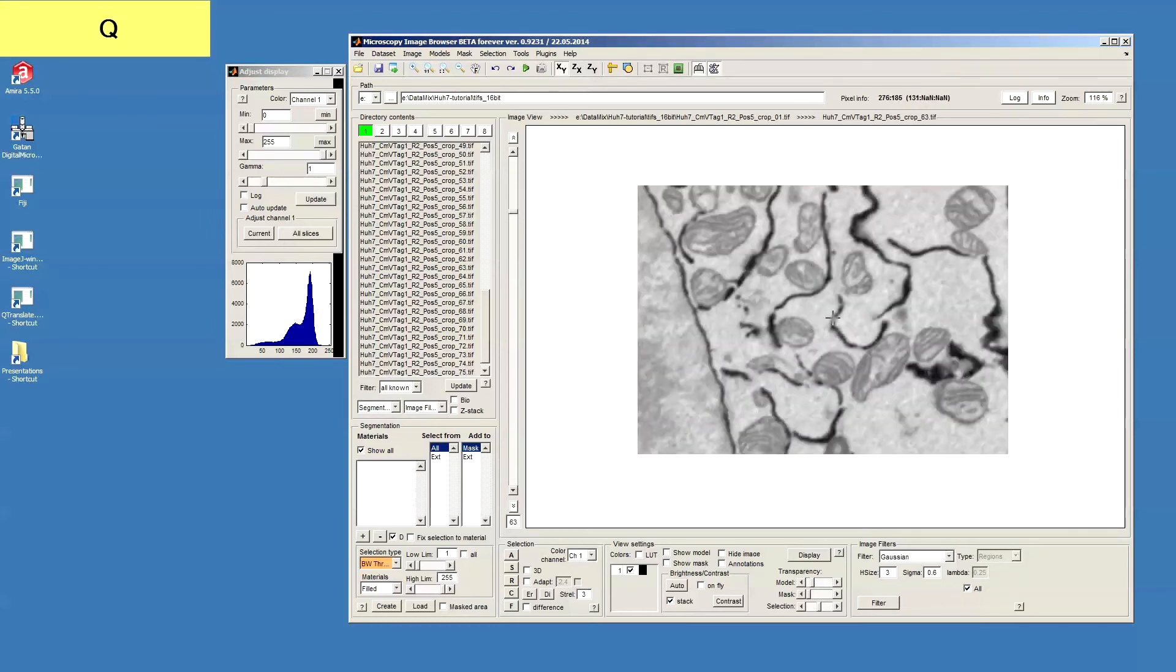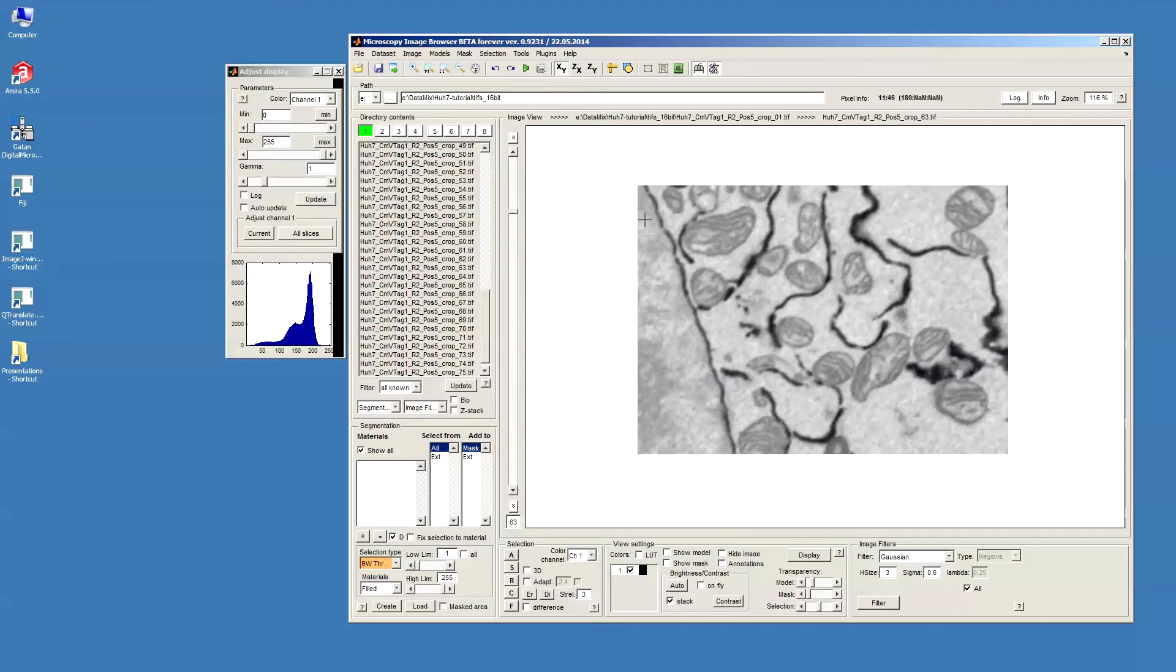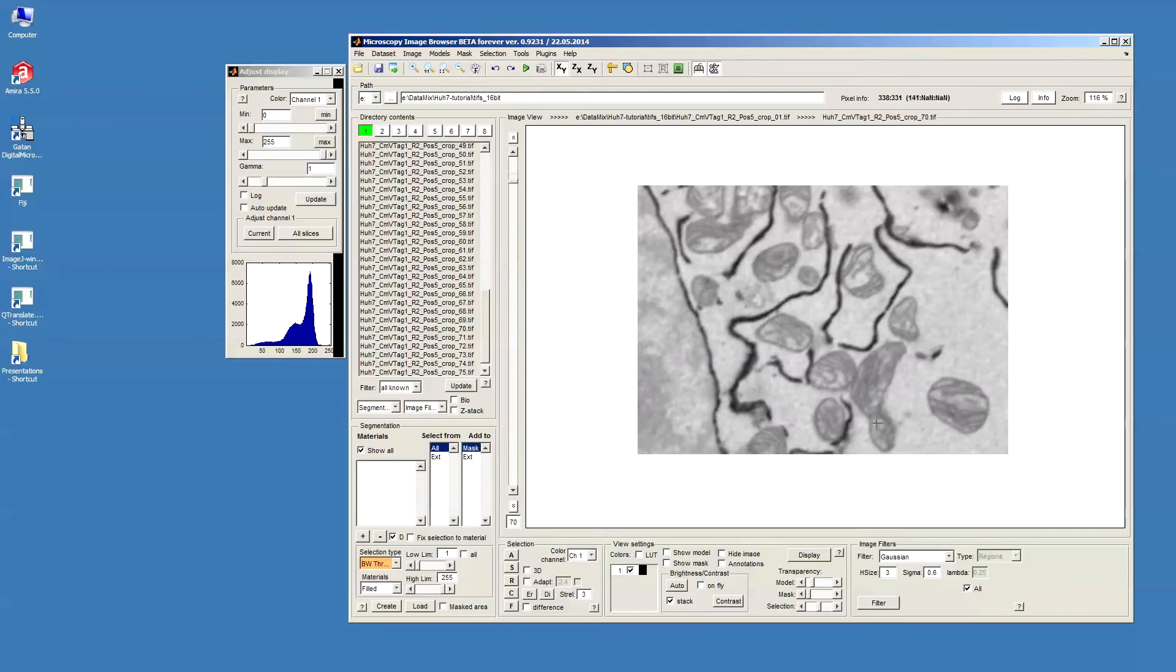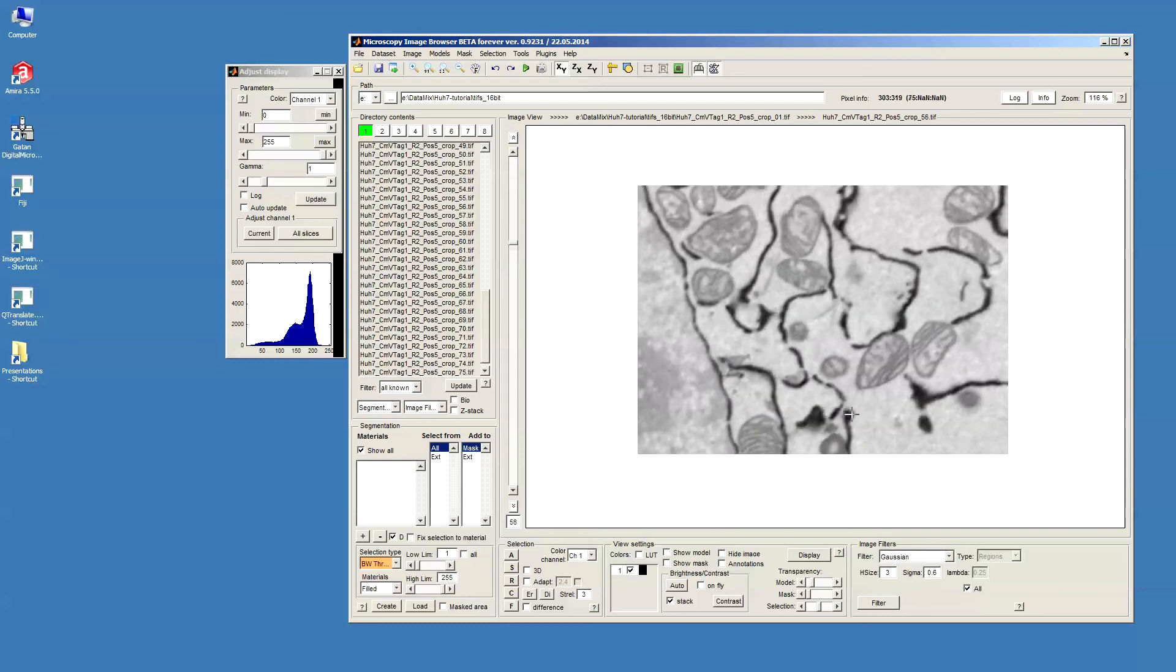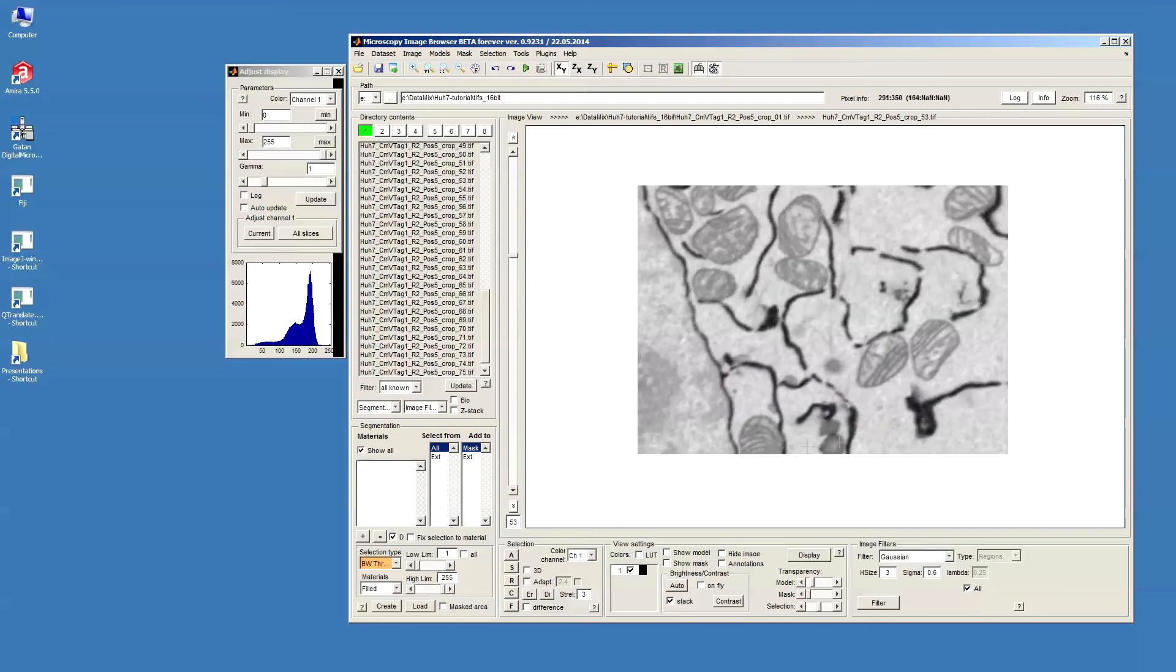So, what is actually segmentation? Segmentation is the process when we assign a label to each voxel of the data and this label can specify what kind of material this voxel belongs to. For example, in this dataset we can have materials which could be a nuclear envelope here, mitochondria, endoplasmic reticulum and lipid droplets like these guys here.